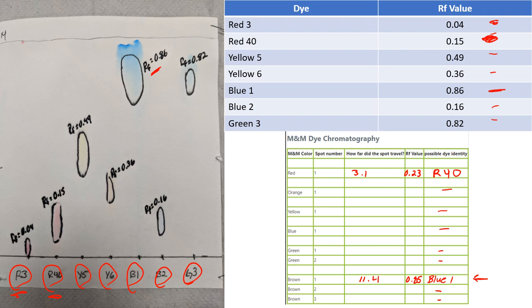I will say that some students have pointed out that the browns have seemingly had 4 as of late. They may have changed the formulation at some point, but we'll just stick with 3 for now. If you can just identify 3 in the brown dye, you've done well.